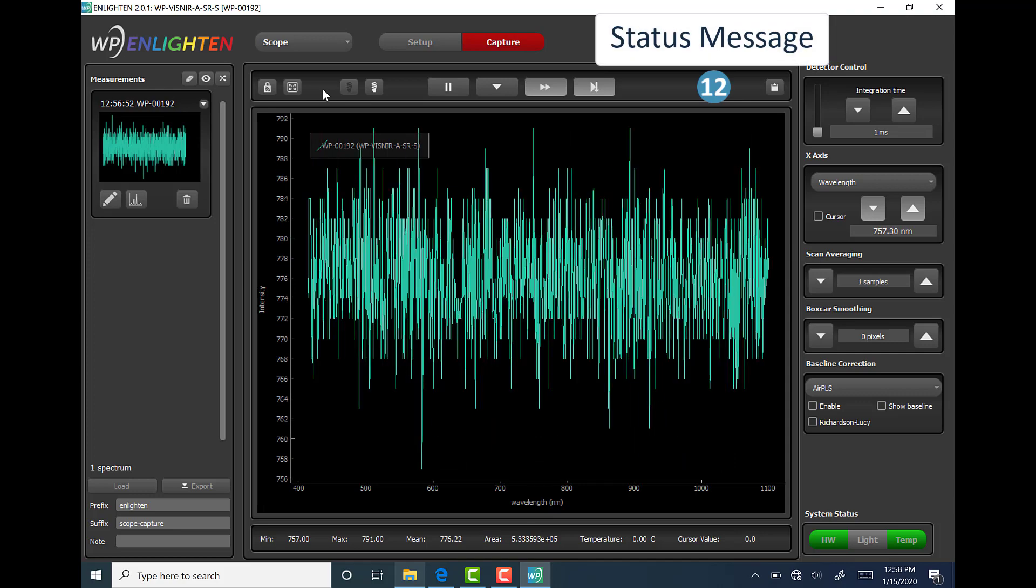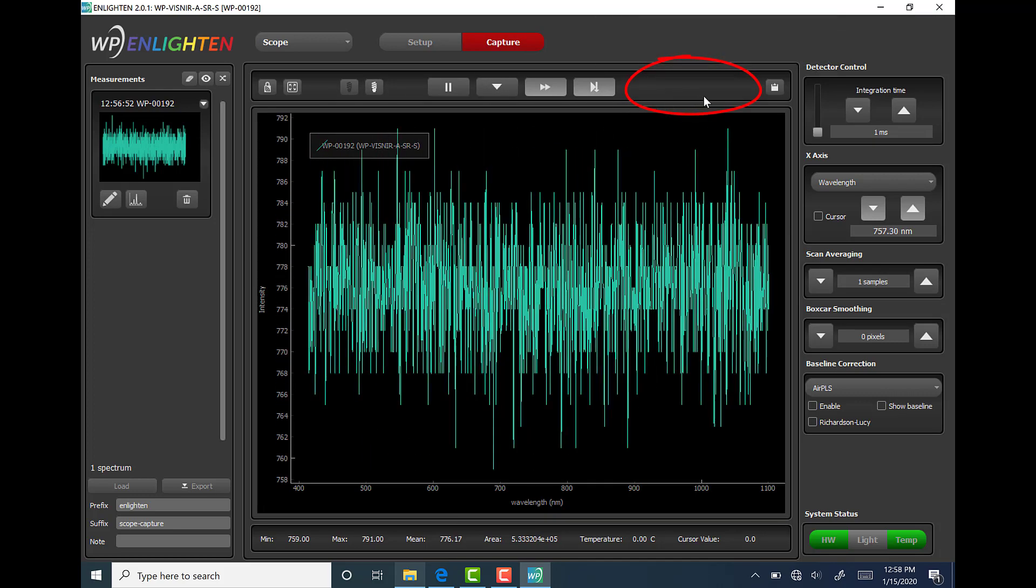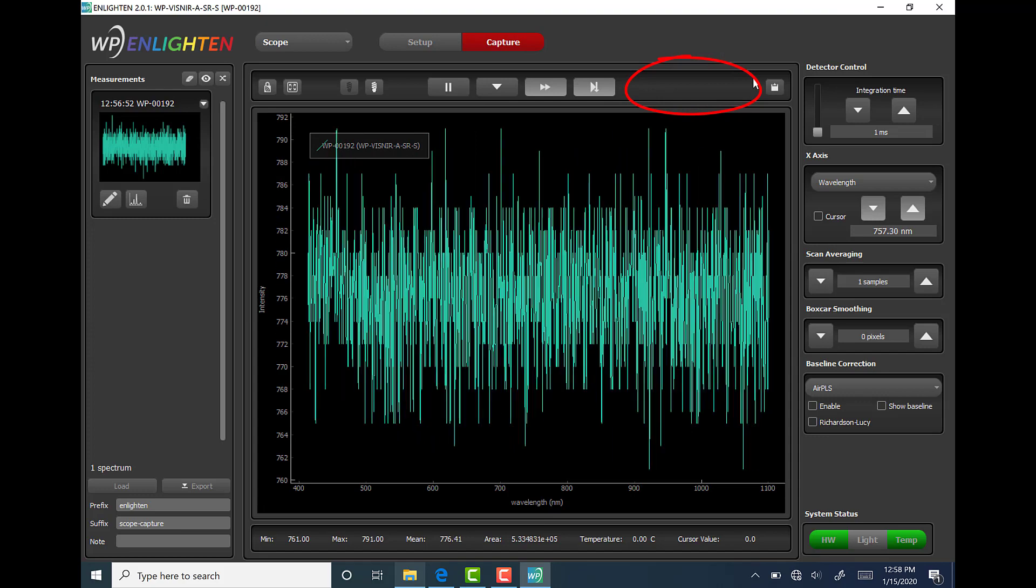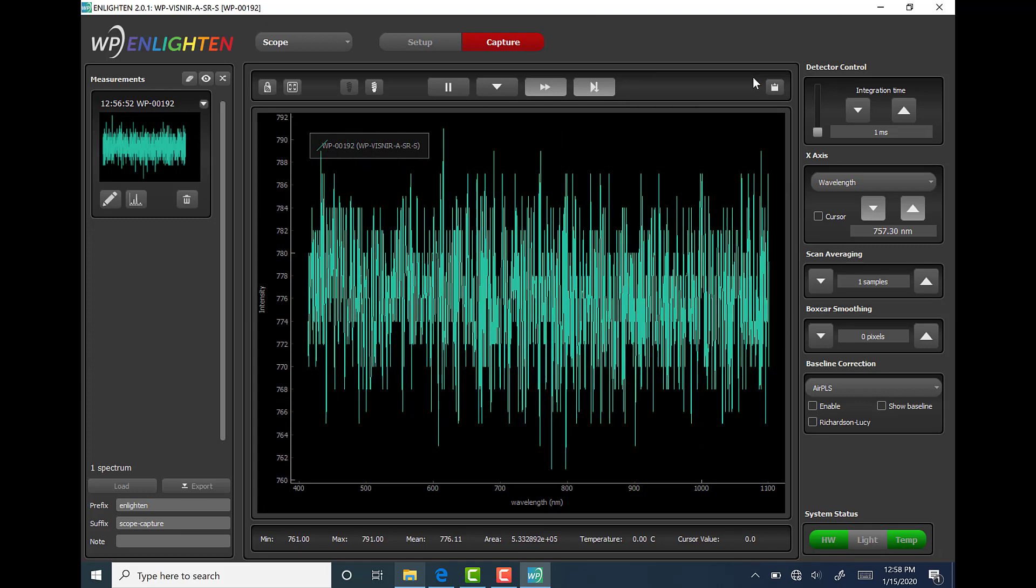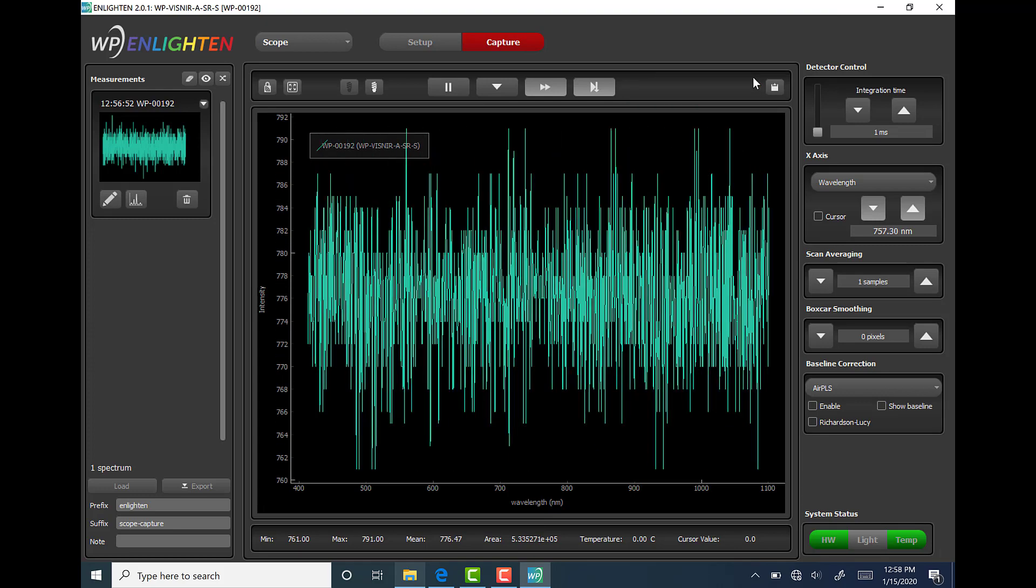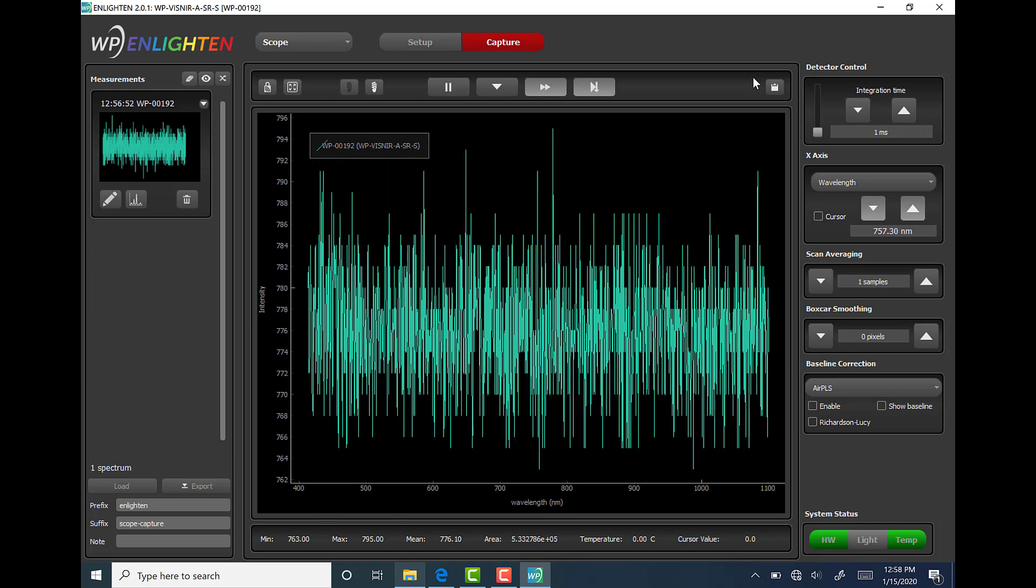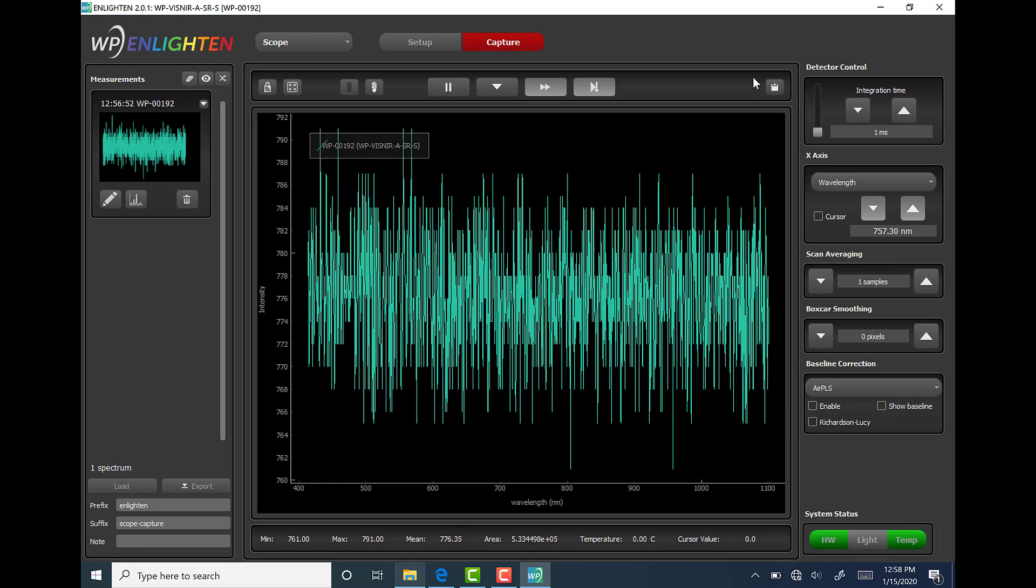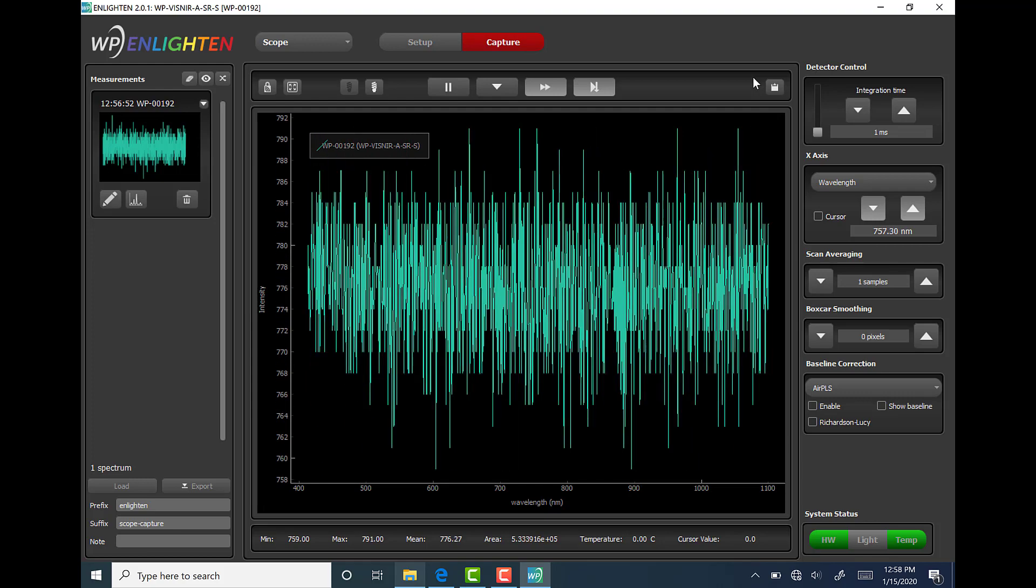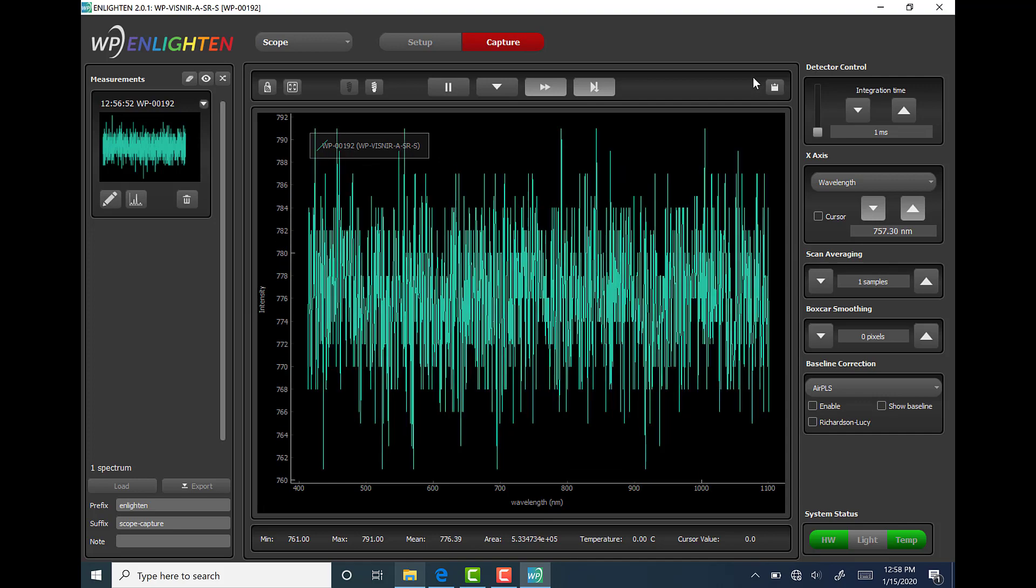Next, the status message area found between the VCR type buttons and area 13, the copy to clipboard button, displays brief status messages for about three seconds before disappearing. One example of when this is used is when batch collection has been enabled and the status message lets the user know which measurement is being collected out of the total number of measurements that the software has been set to collect.